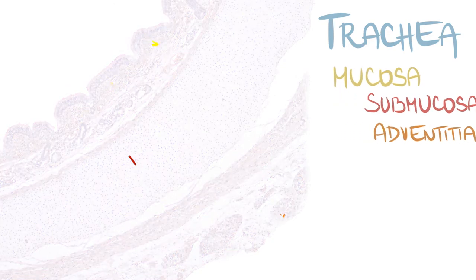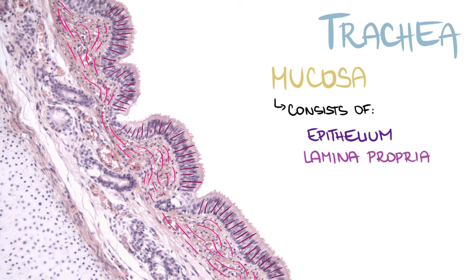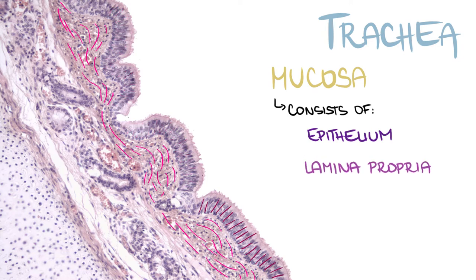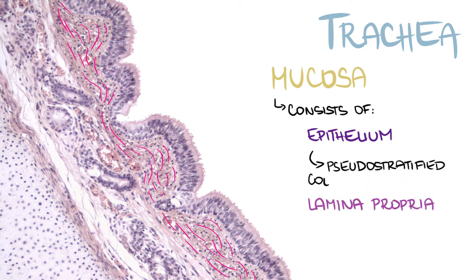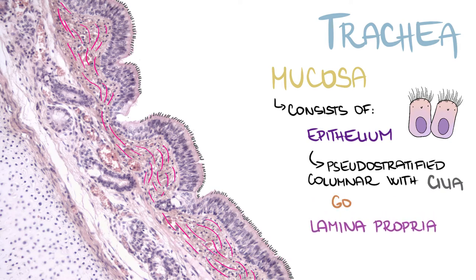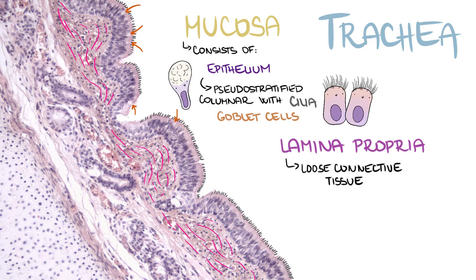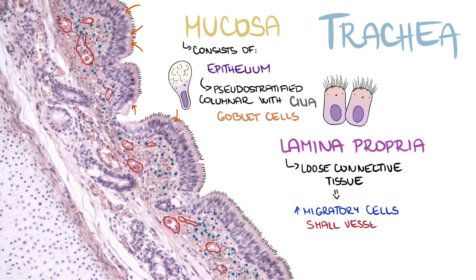Mucosa consists of epithelium and lamina propria. The trachea is lined with a typical airway epithelium, which is pseudostratified columnar epithelium with cilia. We can also find many goblet cells here. Lamina propria is made up of loose connective tissue and contains many migratory cells, small vessels, and ducts of seromucous glands producing watery mucus.